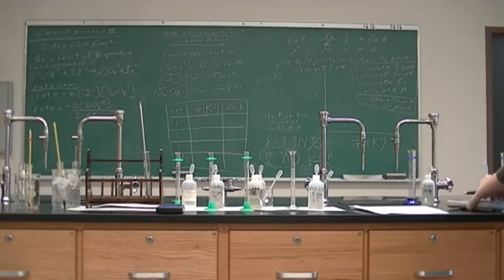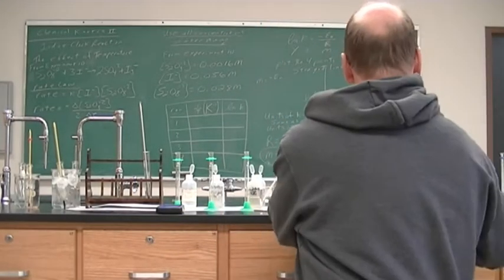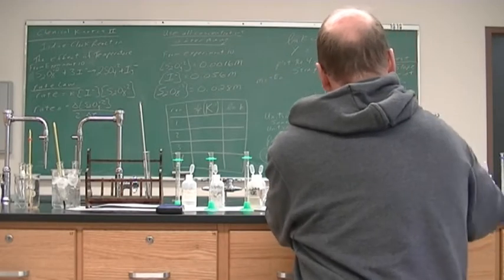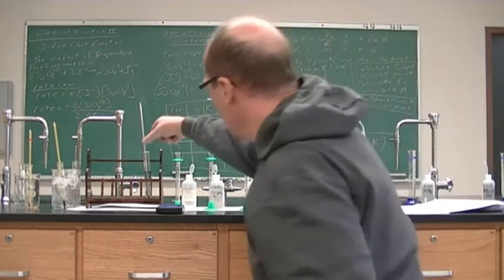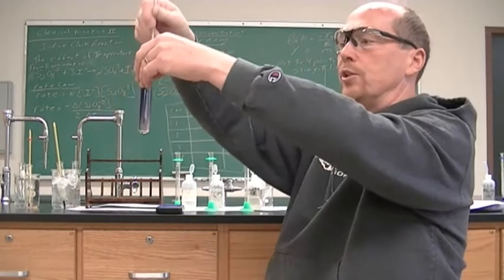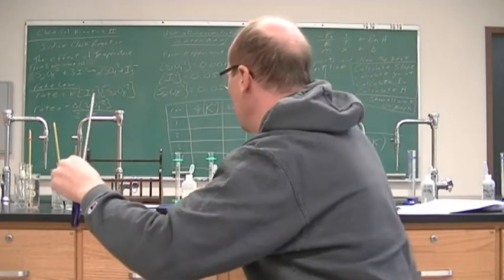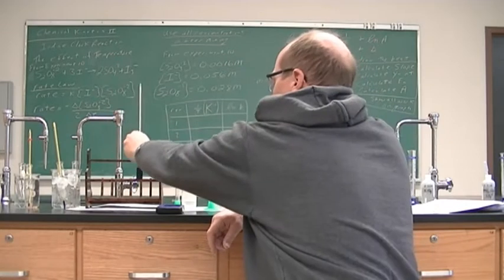And we're waiting for that to turn blue. 22.0 is my temperature in Celsius. Alright, and so we see that it is turning blue. Now for this reaction, we have to make sure the entire solution is blue. It is. We push stop. 1 minute and 45 seconds.